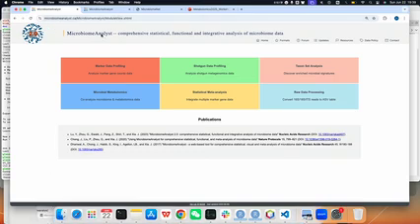So in this section, I will do the demo for the data integration. We will have two parts. In the first part, we'll use the MicrobiomeAnalyst module to do the integration of the two data matrices. So first, we start from here.